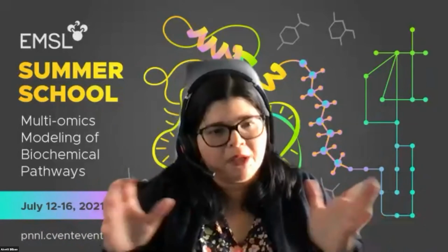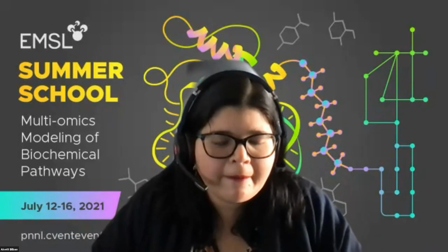There are methods going to those native measurements, and if it keeps that secondary conformation, then you could even see ligand binding or other really cool things that could be more of a true in vivo system.